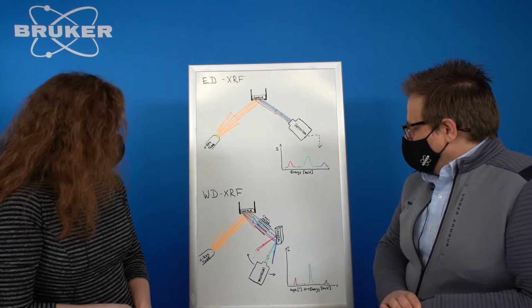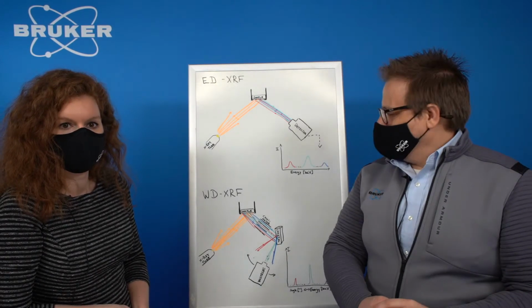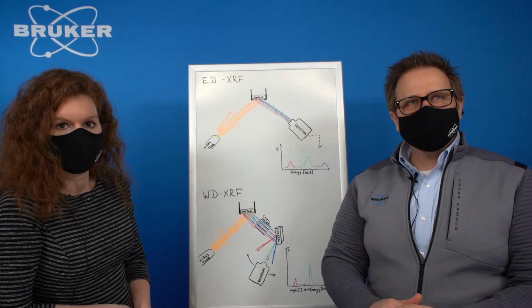Okay, so I think what we have is a video about this instrument, the S6 Jaguar that you've brought along. So we're going to switch over to that.